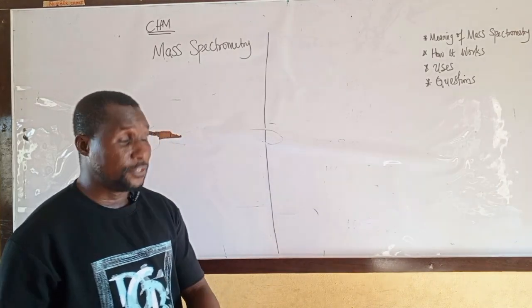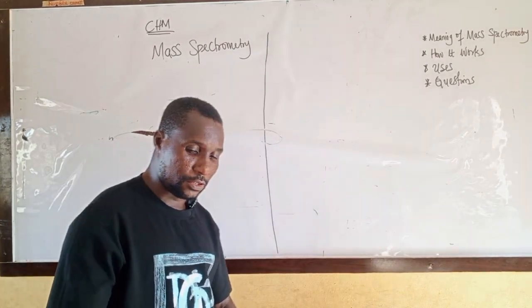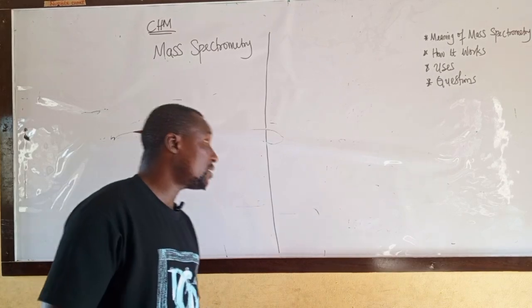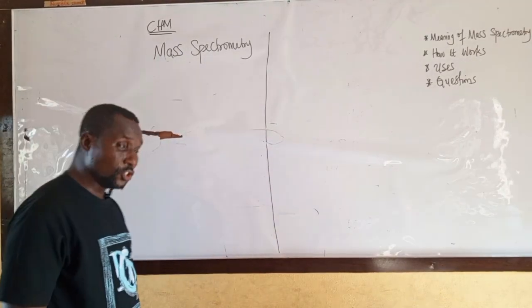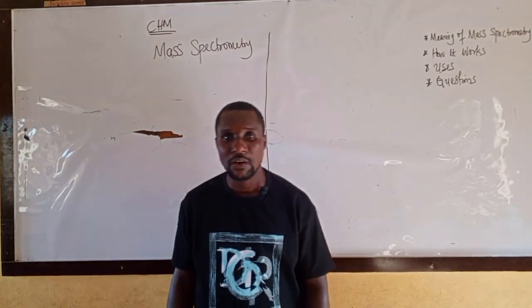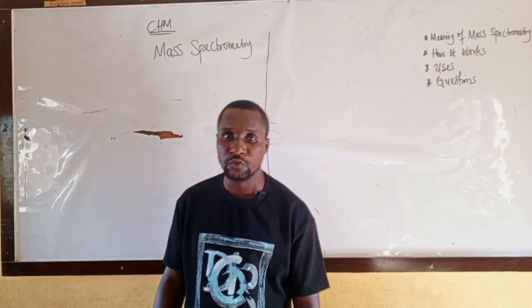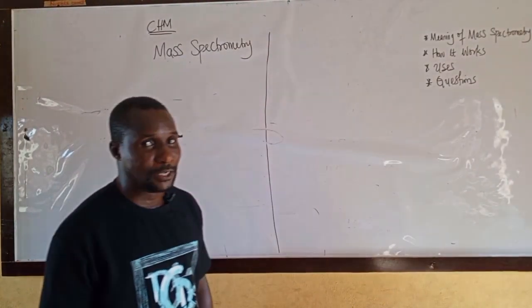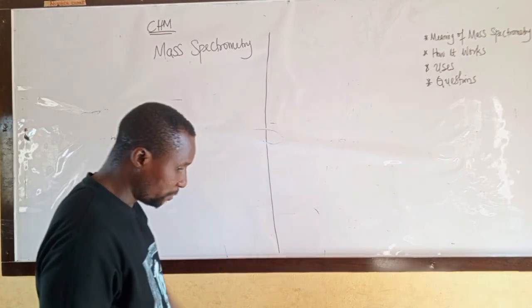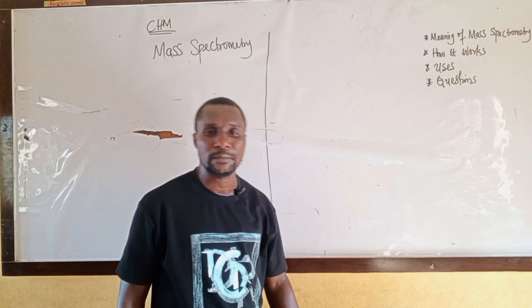In this video, we shall discuss mass spectrometry. Mass spectrometry, which is also known as mass spectrometer or mass spectroscopy. What is the meaning of mass spectrometry? It's a device.